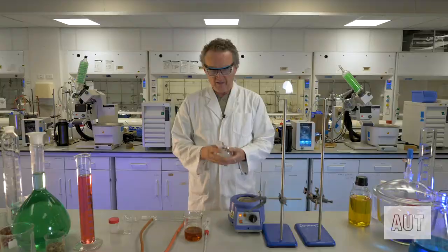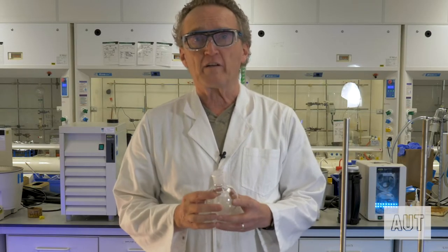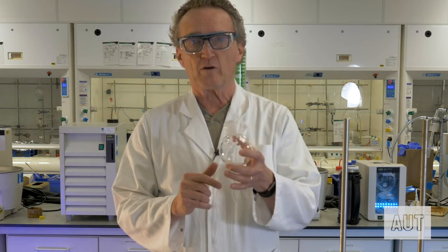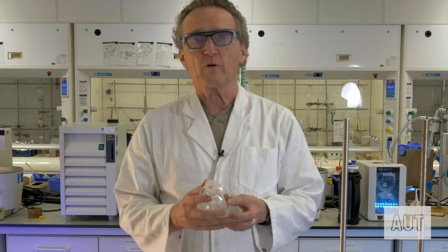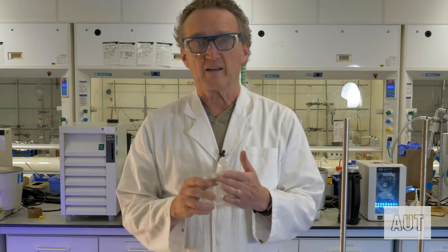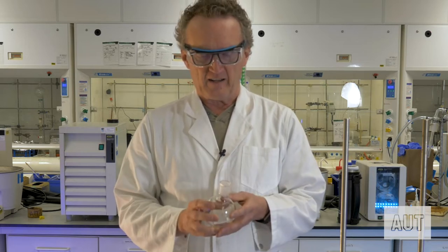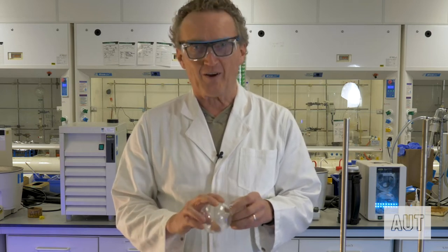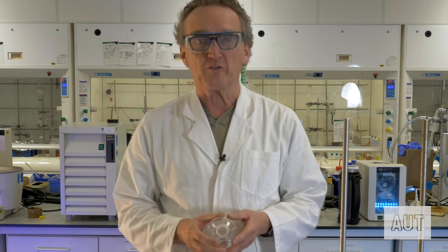Now, first up, this is special glassware. It's called quick fit glassware. You'll see that we've got ground glass joints all over the show. Please be careful with this stuff. It really is rather expensive, with very, very high tolerance in the measurements for these ground glass joints. So don't go dropping them, please, if you can possibly avoid it.